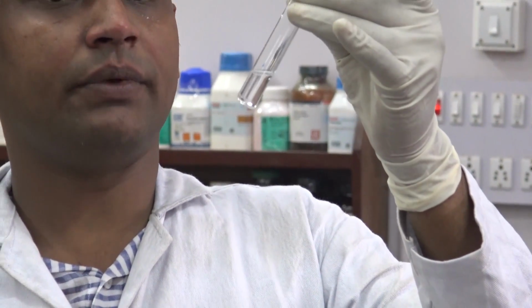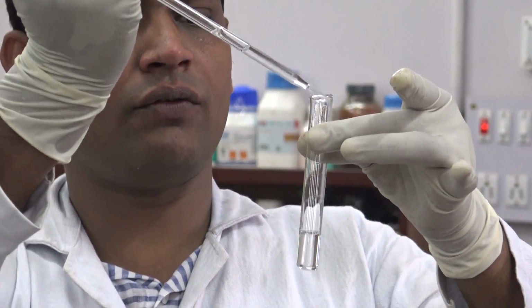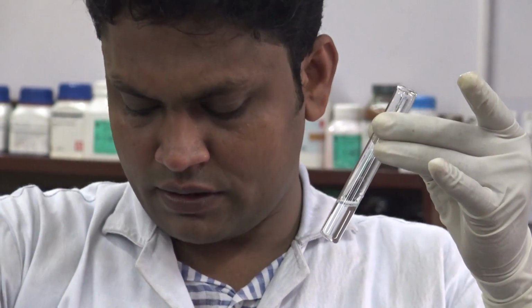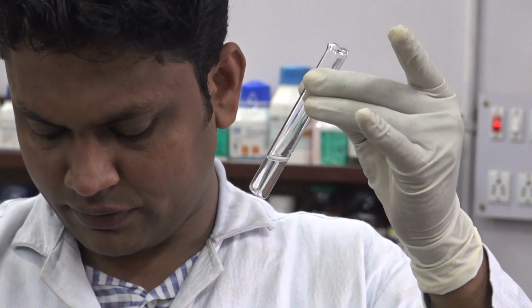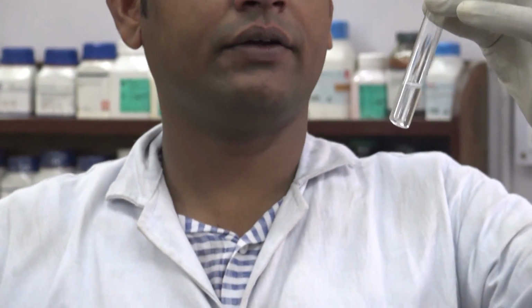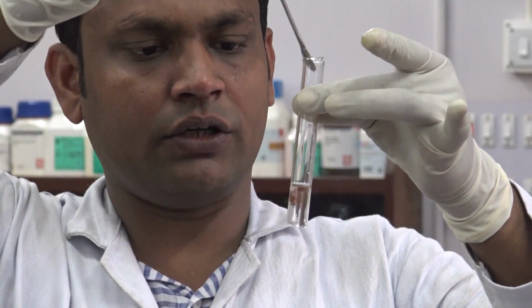After dissolving the sample in distilled water, add few drops of dilute HNO3. After that, add a pinch of solid sodium bismuthate to it.